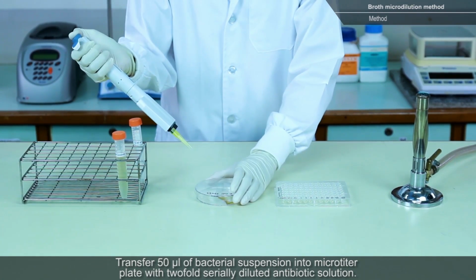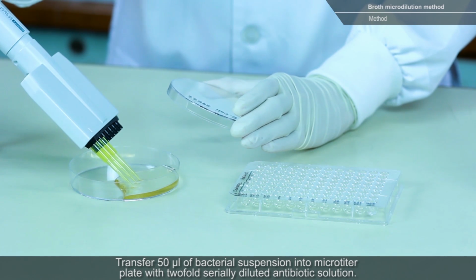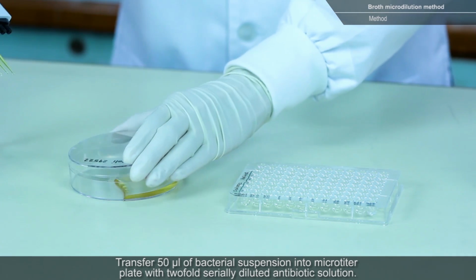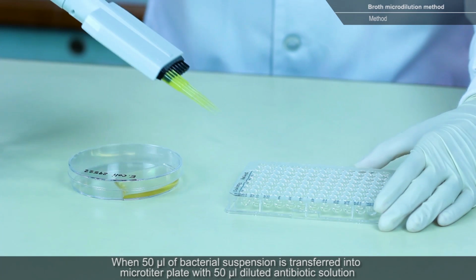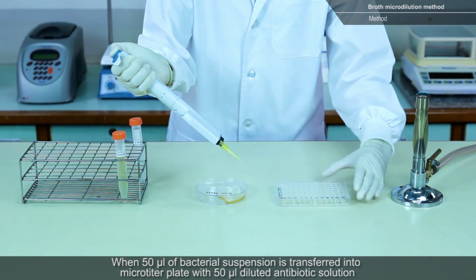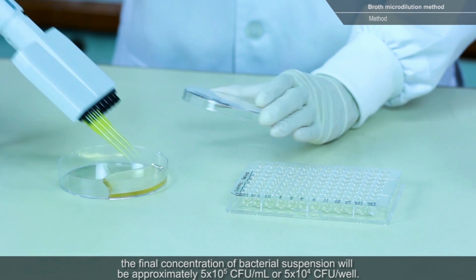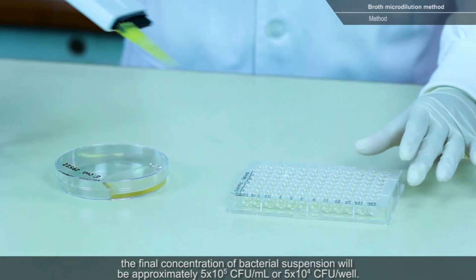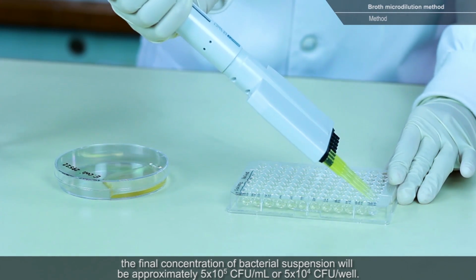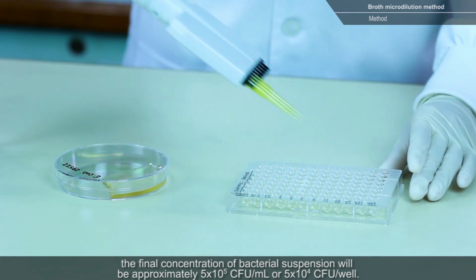Transfer 50 microliters of bacterial suspension into the microtiter plate with the twofold serially diluted antibiotic solution. When 50 microliters of bacterial suspension is transferred into the microtiter plate with 50 microliters of diluted antibiotic solution, the final concentration of bacterial suspension will be approximately 5 times 10 to the 5 colony-forming units per milliliter, or 5 times 10 to the 4 colony-forming units per well.